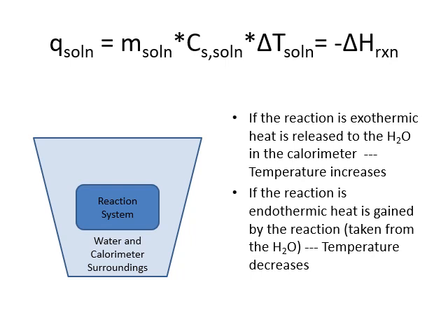We are going to be looking at the surroundings. So we are going to measure the solution because the solution is going to absorb all of the heat that the reaction gives off, or it's going to provide the heat that the reaction needs. And it's much easier to measure the water molecules and the excess water molecules surrounding the reaction than it is the individual molecules that are participating in the reaction.